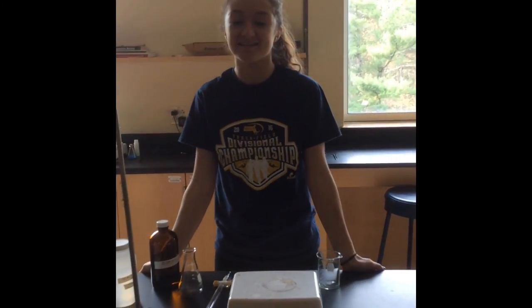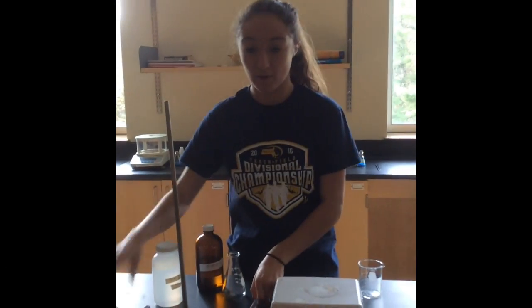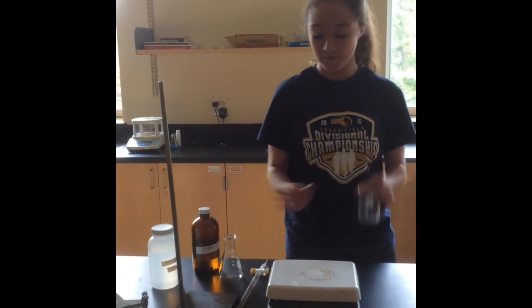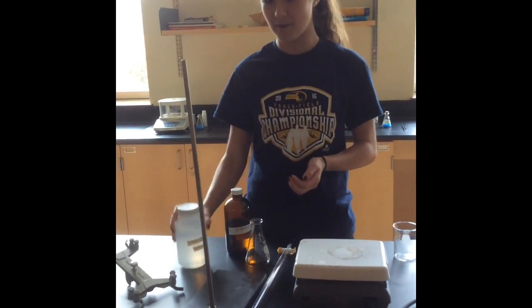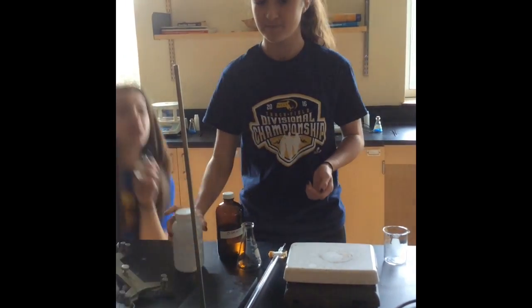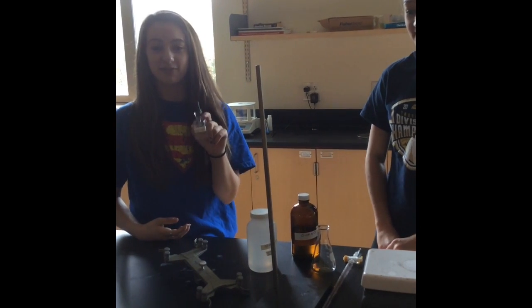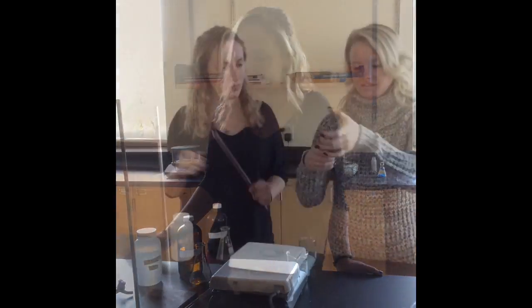In order to conduct a successful titration, you need a ring stand, a burette clamp, a burette, a stirring plate, a stirrer, a beaker, an Erlenmeyer flask, an acid of HCl, and a base of NaOH. Don't forget phenolphthalein. It's the only way we can possibly detect whether these two evil villains have stopped fighting. Really important. Here's how we set up your titration.